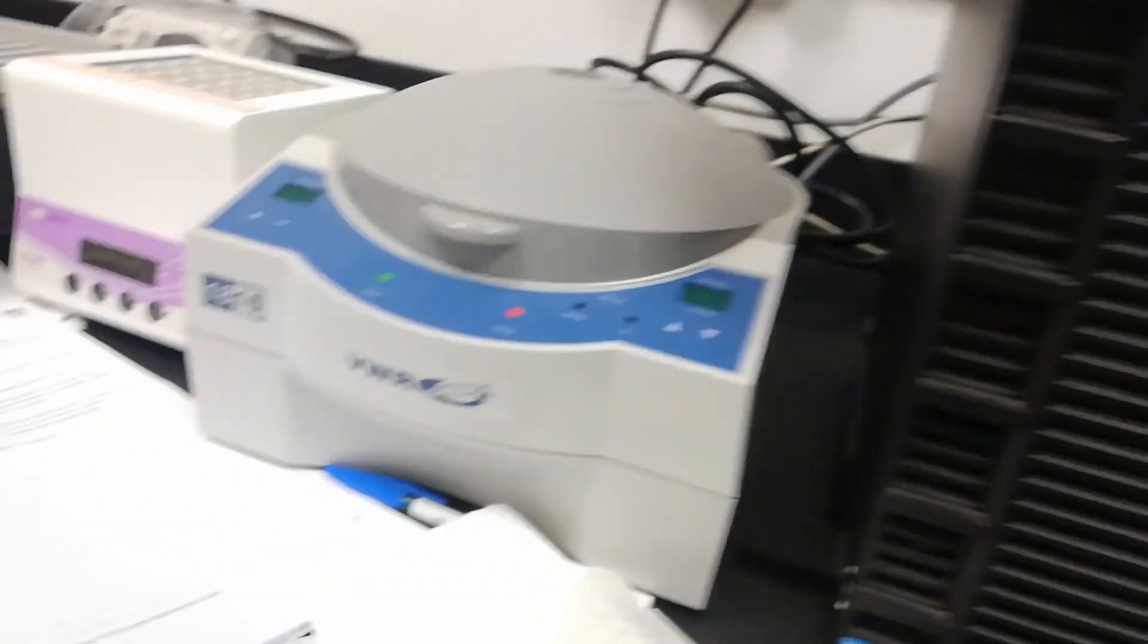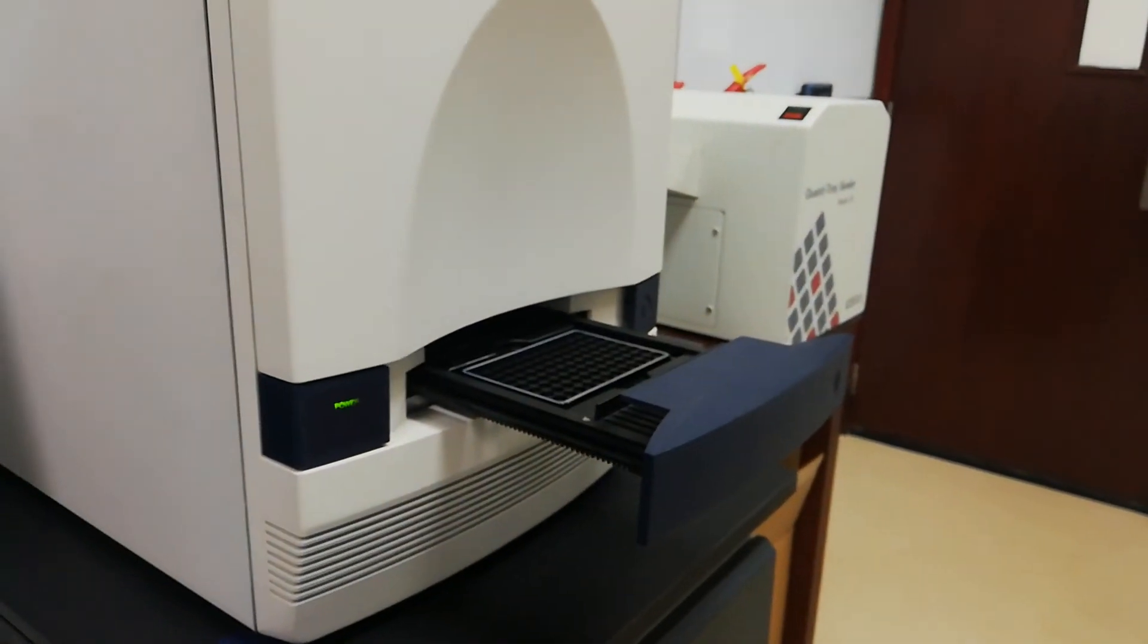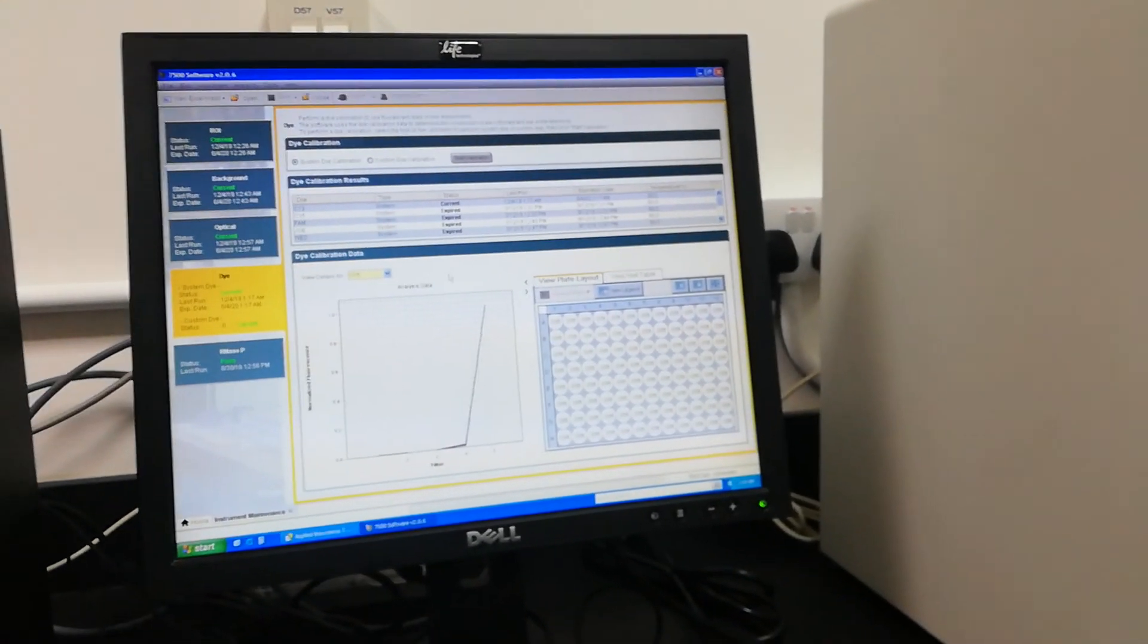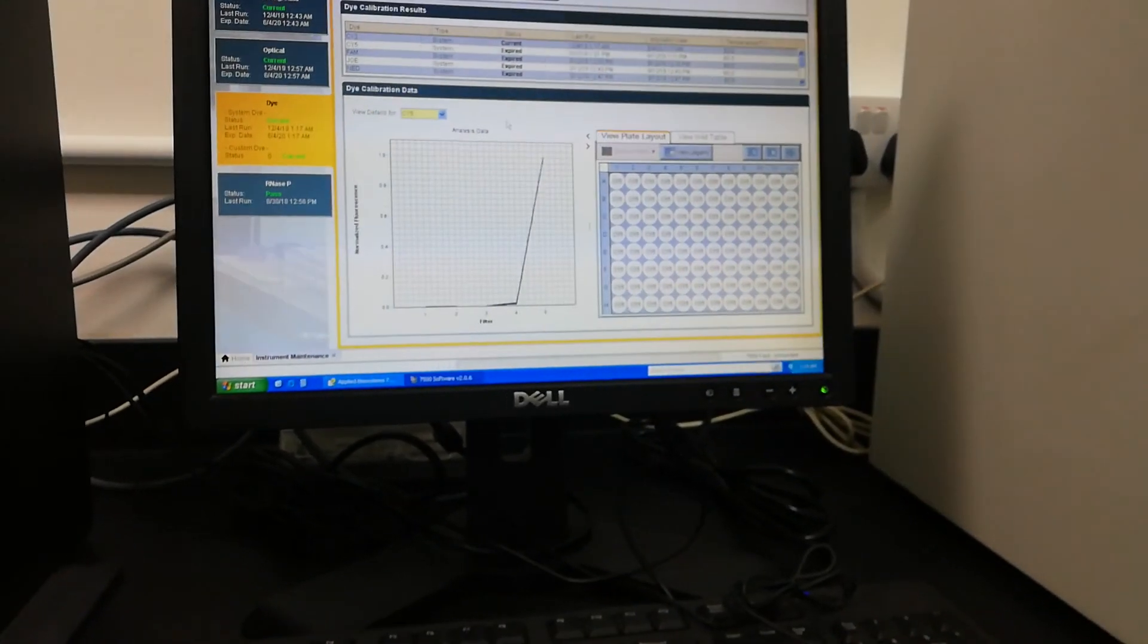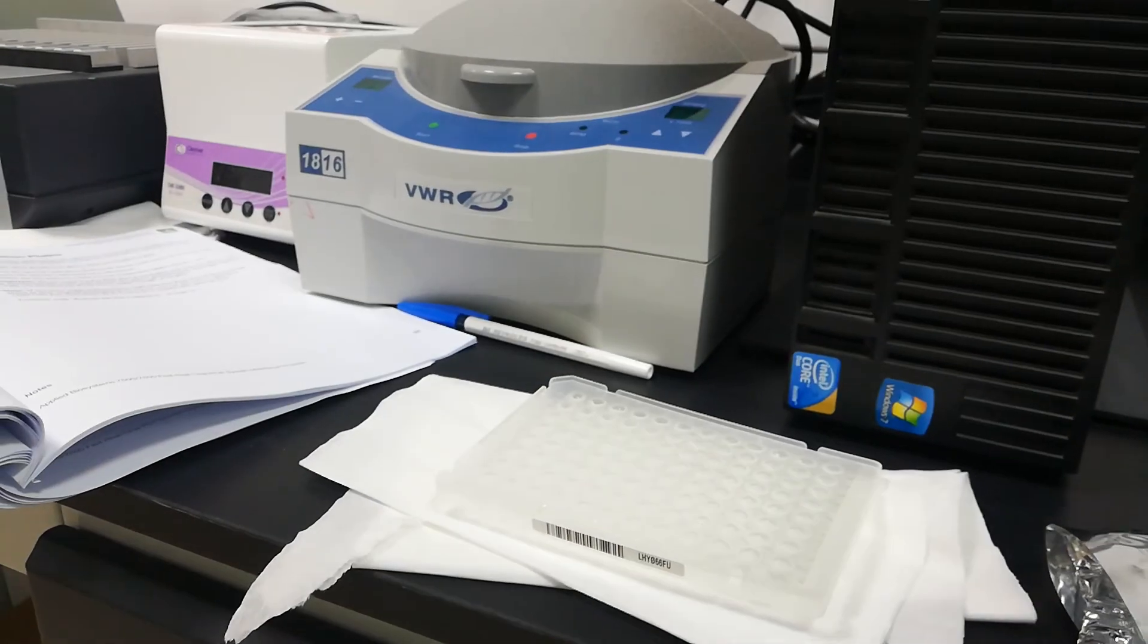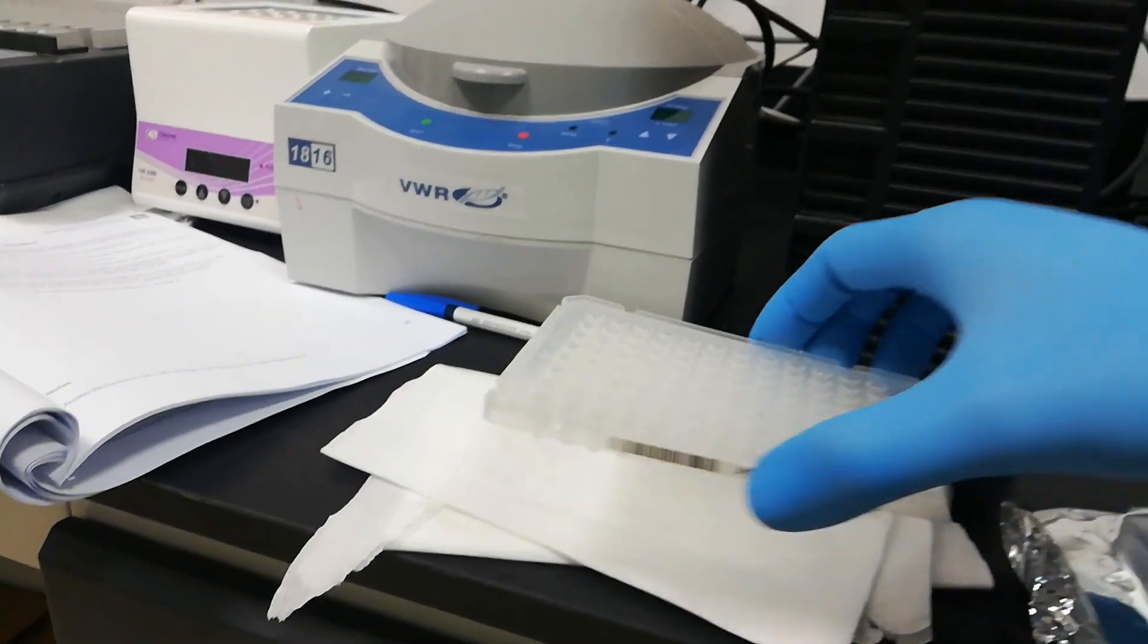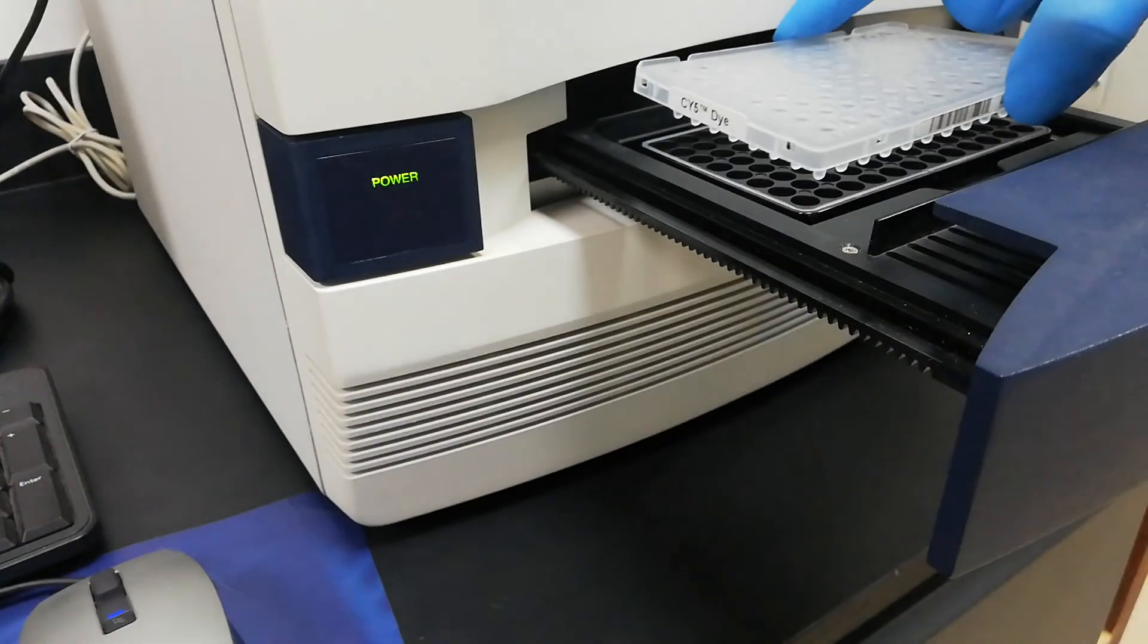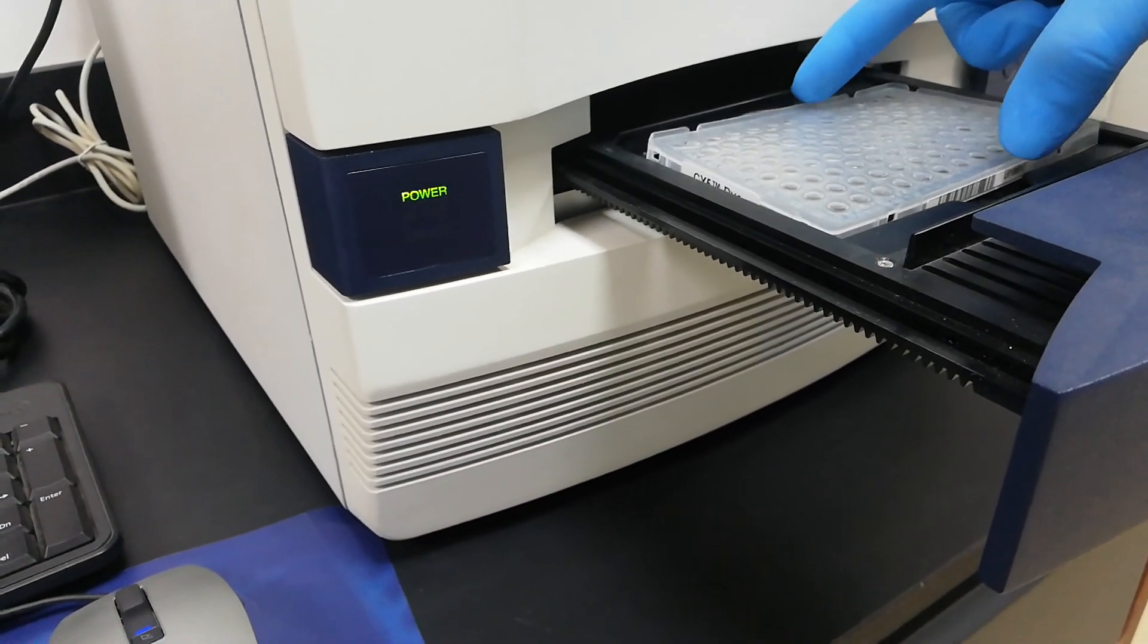I have just taken out the plate and will do the exercise again. After five minutes at room temperature, I am just keeping this plate. Here is the CY5 plate. Push it in.